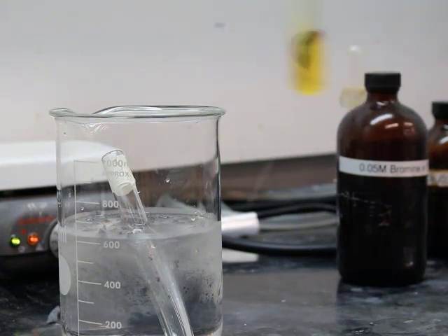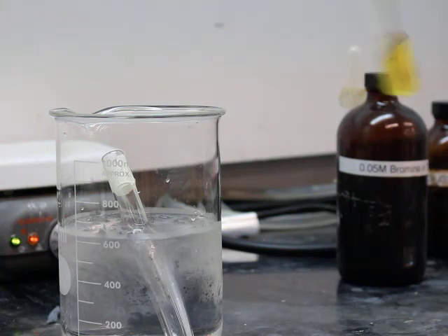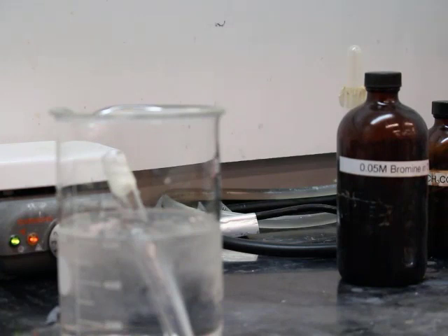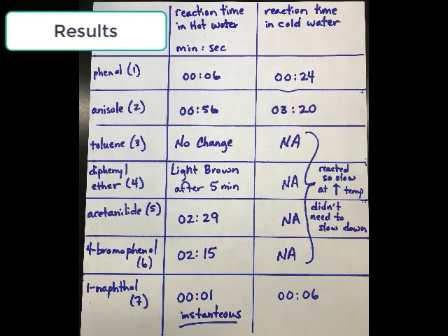That went light. That's like light orange real fast. Let's see how long you're going to take. That's yellow. Oh, it's done. That's yellow. Stick a fork in it. We're going to take that potato out of the oven. I need a picture. Give me a picture of that yellow solution so I know that it's done. I can move on to 1-naphthol. Yeah, that's big yellow.